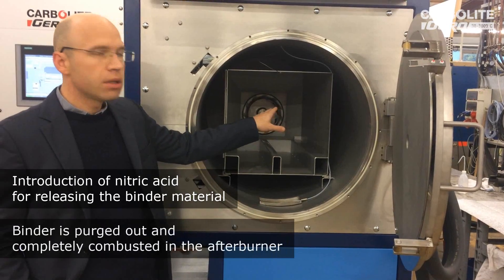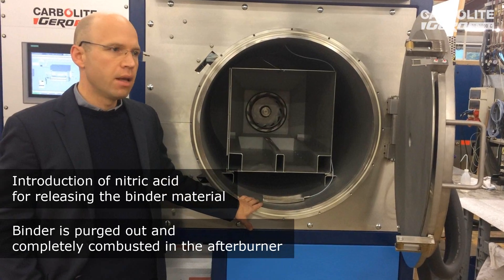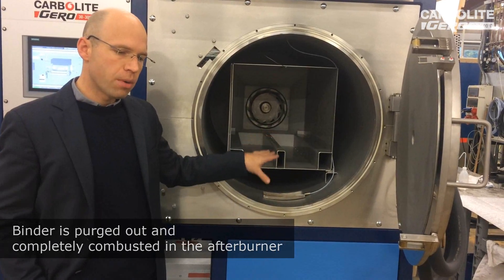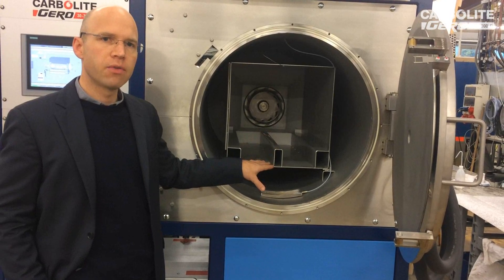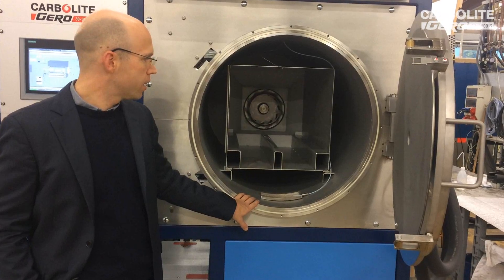The binder is then purged out and completely combusted in the afterburner. If the debinding is finished, the temperature drops again in the afterburner, and we have the possibility to automatically stop the debinding procedure.